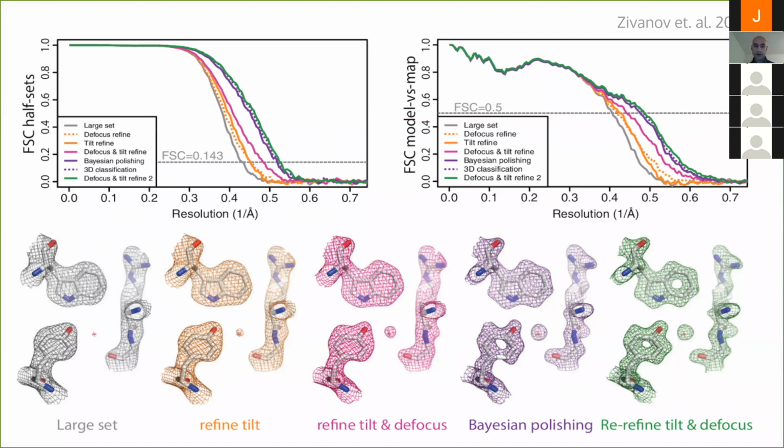Now, there are a lot of data sets that you don't see published or hear about because they never really went to higher resolution. There are a lot of them that stop at maybe 10 angstrom, or even 8 or 6 angstrom, that people can't really use to do proper biology on. And the aim of the work, when I got involved in this, was to try to get those data sets to go to higher resolution, to actually enter this regime where you can start applying these kinds of algorithms to push the resolution even further.